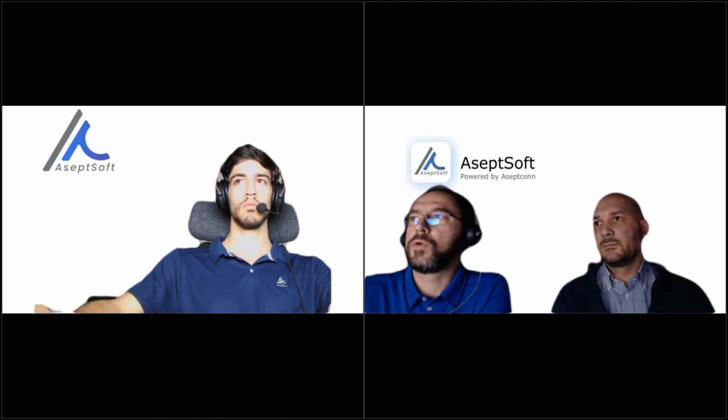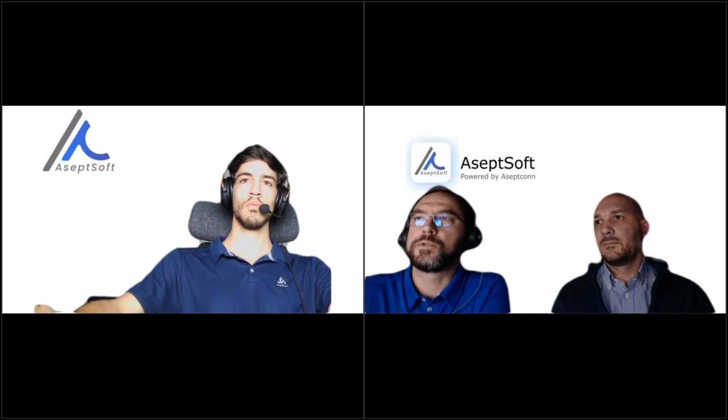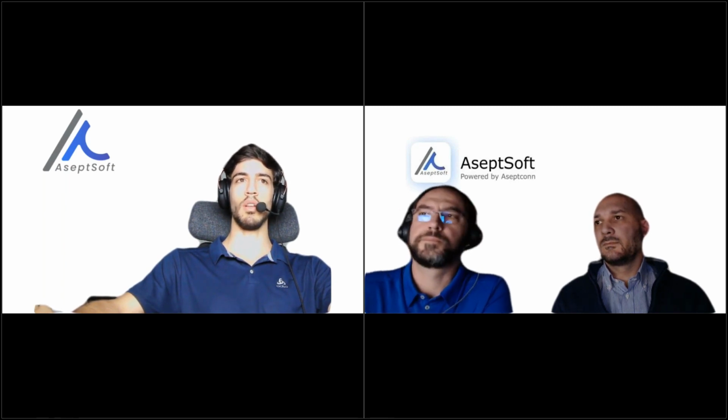So now let's see, we received some more questions. Is it a single purchase for the software or a recurring license? So Dimitri, please, you can answer this. Thank you, Cosmin. It is a recurring license. We offer more subscription plans, and we can also have custom plans depending on your needs.